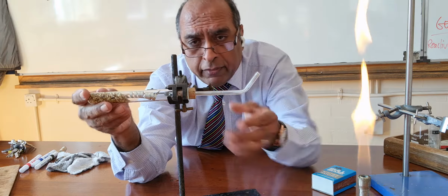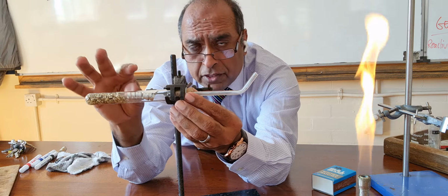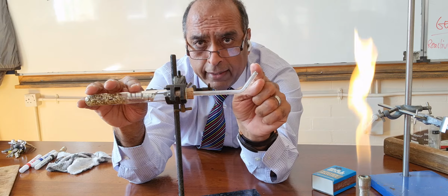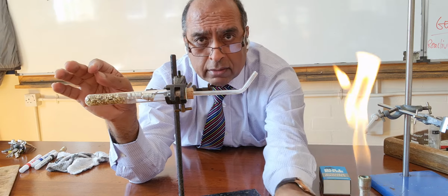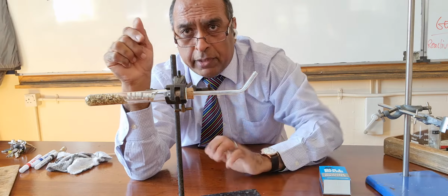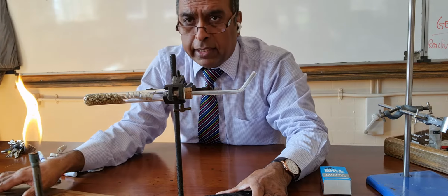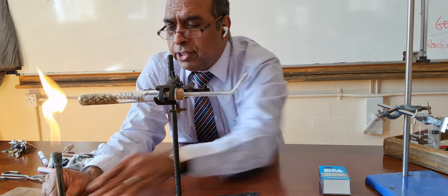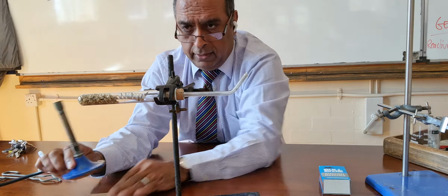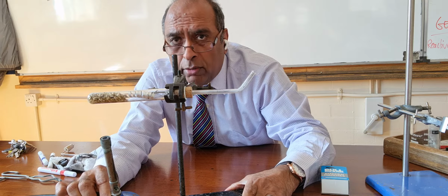Magnesium here. There's a tube on the end, a delivery tube, where if there's a reaction, then any gas will be forced to come out of here. And if it's hydrogen gas, I should be able to light it. Well, we'll see. Put that Bunsen burner to one side for a minute. I just need to get steam. And how am I going to get steam? Well, I'm going to get the steam by putting a roaring flame on this bit here, on the ceramic wool.